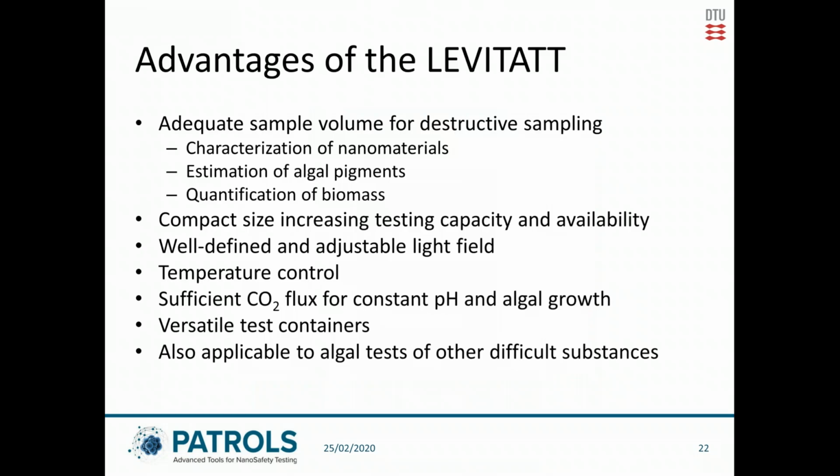So the advantages of the LEVITATT is that it has an adequate sample volume, as Anders also mentioned, so we are able to do destructive sampling. For instance, characterization of nanomaterials, for instance, for size or for concentration. Also estimation of algae pigments, if there are changes in the pigments due to colored substances, or they are shaded by intershading or by localized shading of nanomaterials, for instance.